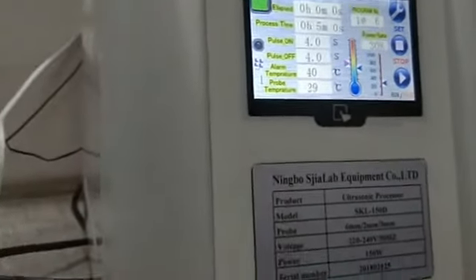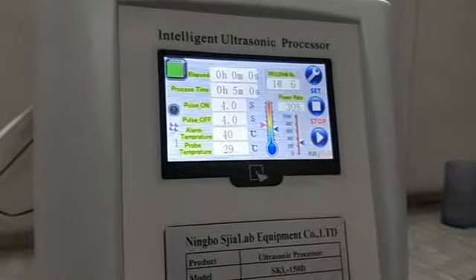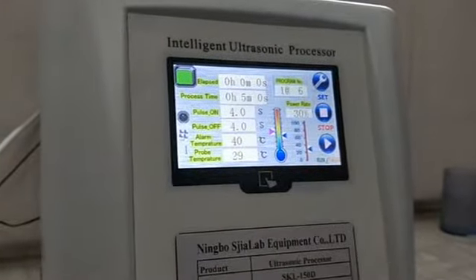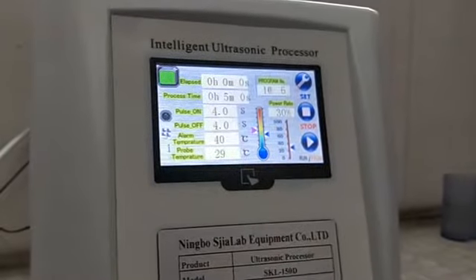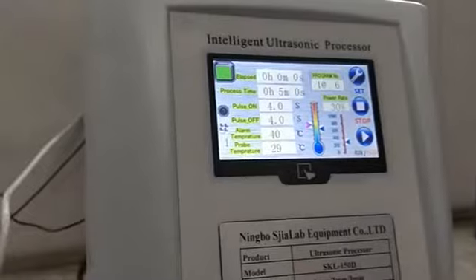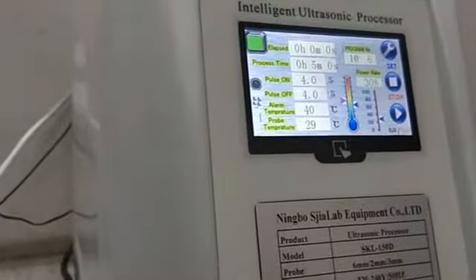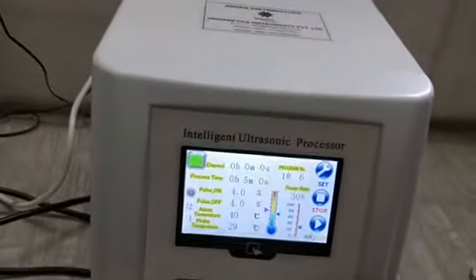The good thing about this controller is that this is a touchscreen controller. This is the first machine in India with a touchscreen. The models before this were not touchscreen models. This is a very simple interface with the user. Here we can store up to 19 programs.